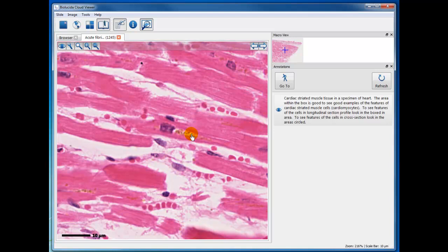which is really an accumulation of lysosomes and organelles they have digested. Remember that cardiac muscle tissue, as a rule, doesn't regenerate, although in recent times stem cells have been found in cardiac muscle, and they can be stimulated to replace cardiac muscle tissue. The same thing is happening in the brain. We're learning more and more about that. And here's another capillary. You see just one red blood cell within the capillary. This is probably a lymphocyte in the tissue here.